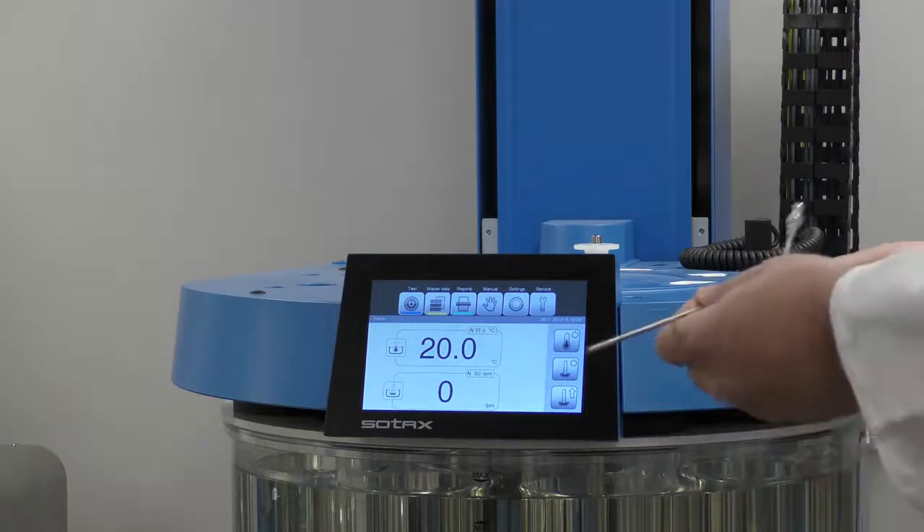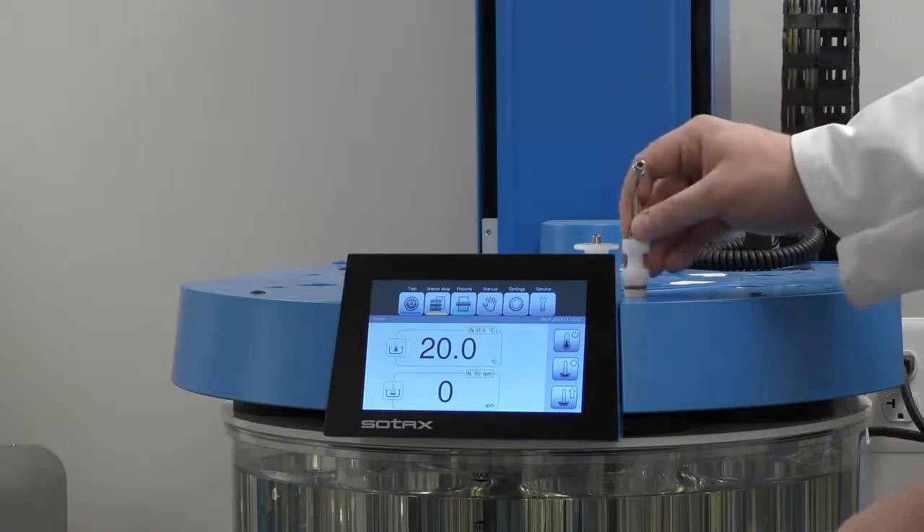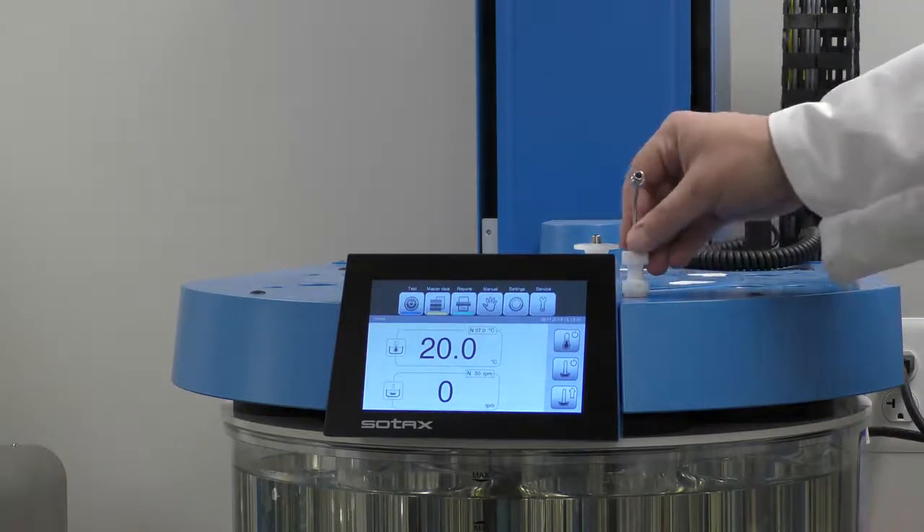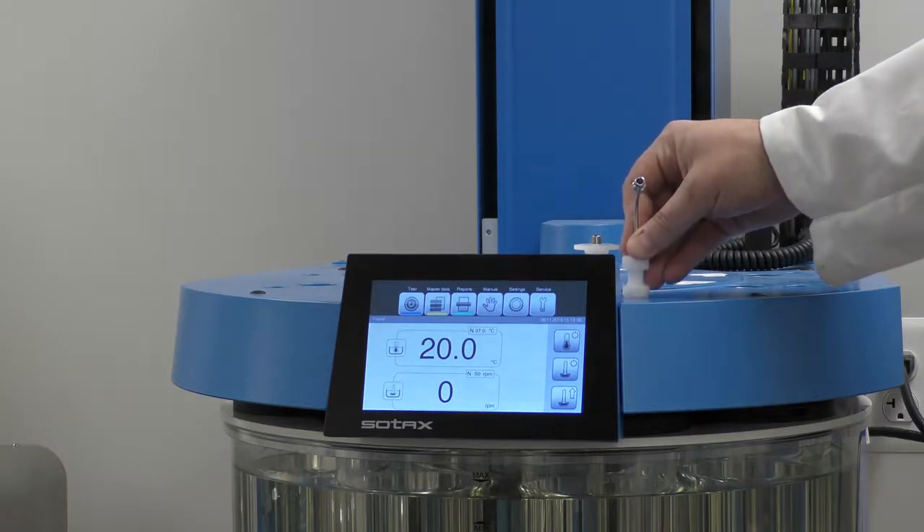Next we simply take the probe assembly and insert it into the hole in the top of the tester for the position to be tested, and push it all the way down.